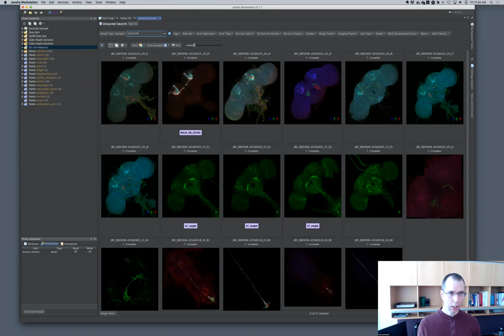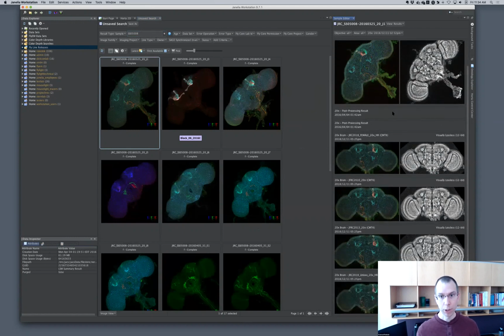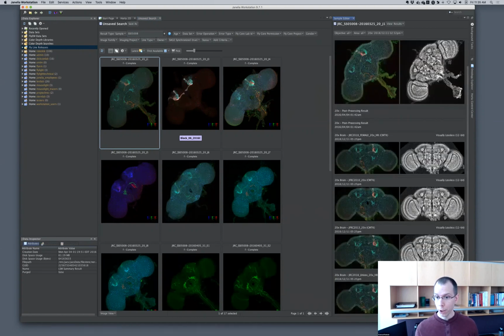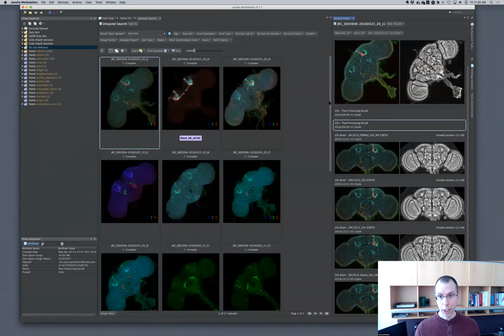And so the way that looks is, we built some viewers in here. You can look at all the processing that's been done on any of these images. And again, this is specific to Flylight. For Flylight, what we're doing is we're processing everything on the back end with standardized algorithms. So applying distortion correction and stitching algorithms and some registration to standard brains and VNCs. And you can sort of just browse this data here in 2D.